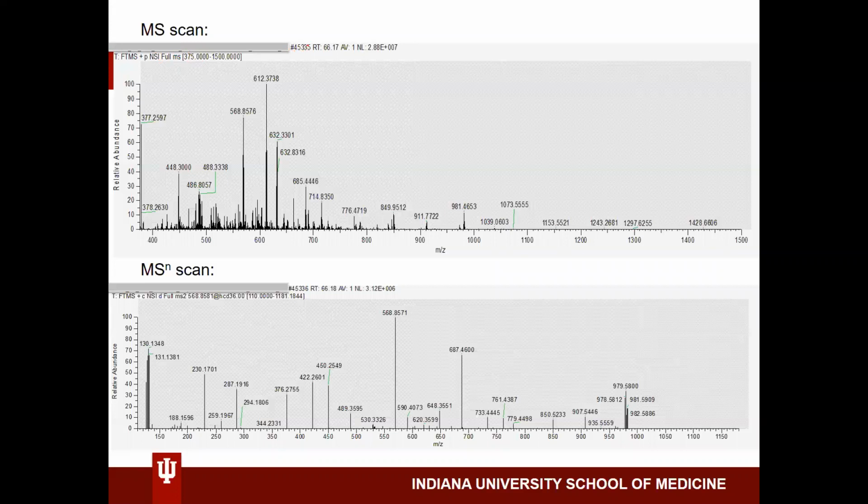Here at the top, you have the scan number or the retention time that you have clicked on in the chromatogram, and the average abundance in the scan. And so here you can see all of the different ions present in one precursor scan. And so in previous lectures, we talked about different methods of acquiring data, data dependent or data independent. And you'll be able to walk through your raw file and see what sort of method was used and how the data was acquired.